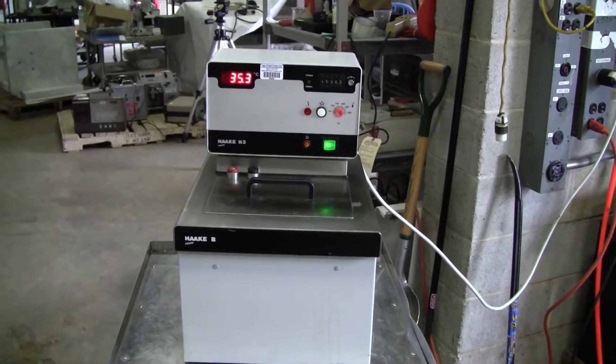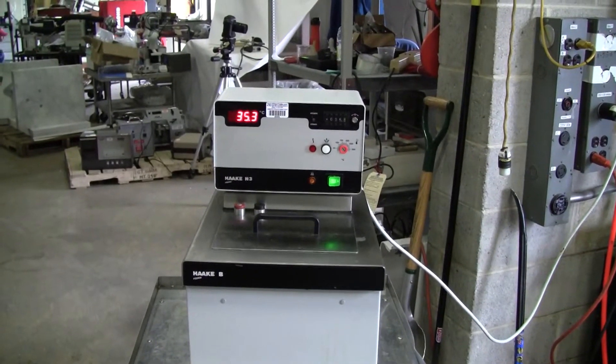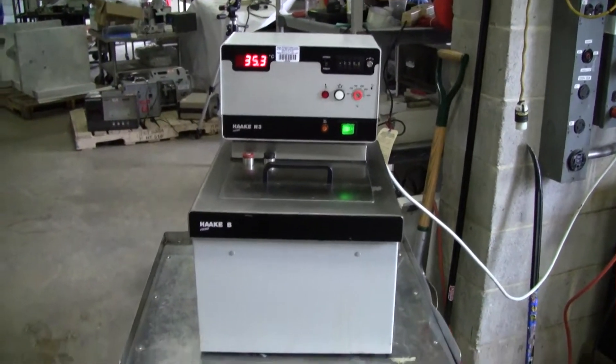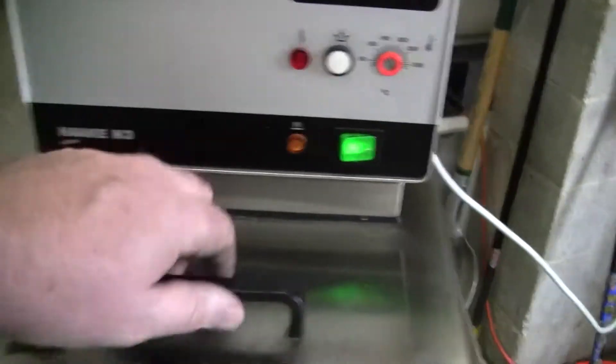Hi, this is Jim from HitechTrader. We're going to get looking at a Haake Fisons hot oil bath. The bath is a B, the controller is an M3, and it's got a 14 liter capacity.